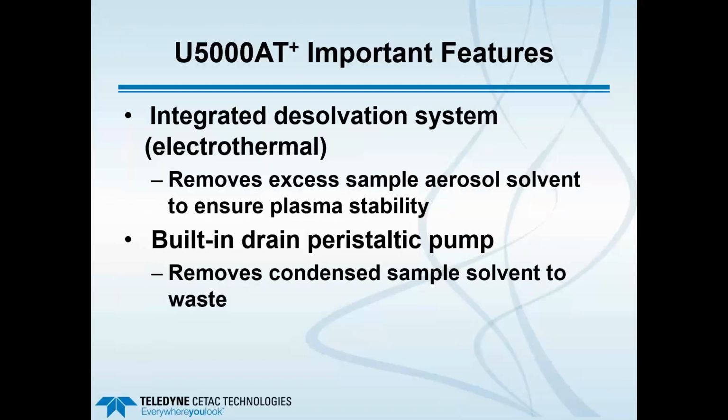Two important features I want to mention about the ultrasonic nebulizer: it has an integrated desolvation system, which is electrothermally cooled, so there's no recirculating cooling liquid necessary. This removes excess sample aerosol solvent to ensure plasma stability. It also has a built-in drain peristaltic pump mounted on the back panel of the unit that removes any condensed sample solvent to waste. That peristaltic pump is not used to move sample liquid to the nebulizer.